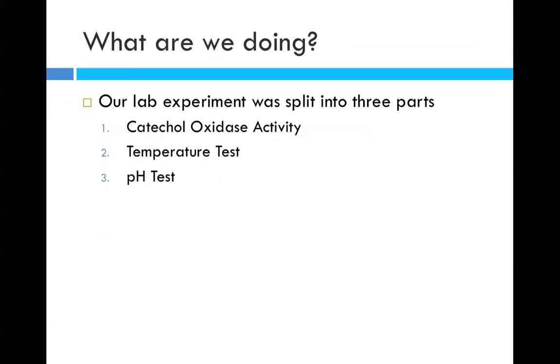Now, what are we doing today? Our lab experiment was split into three parts. We had the catechol oxidase activity, the temperature test, and the pH test.